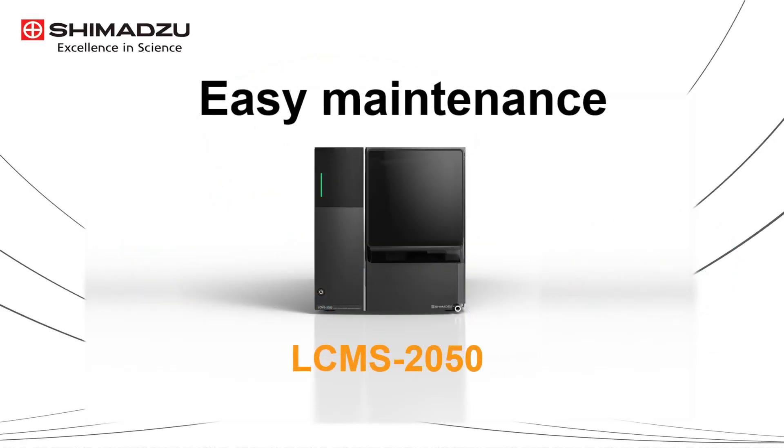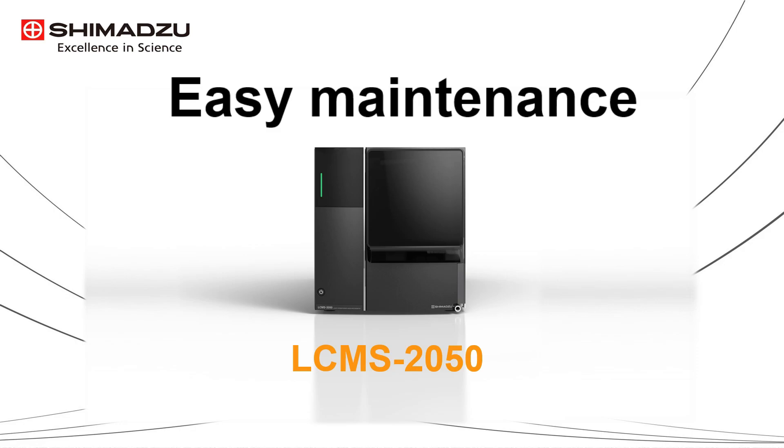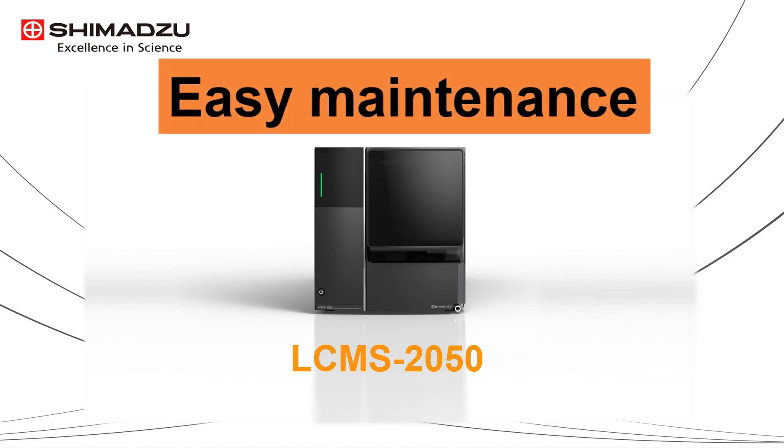True, but this is not really the case for Shimazu LC-MS 2050. The LC-MS 2050 is designed to be easily maintained by the user. Let me show you how I perform the maintenance on LC-MS 2050.